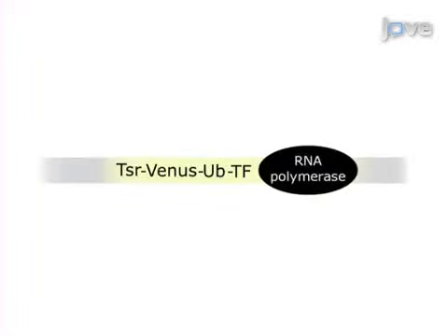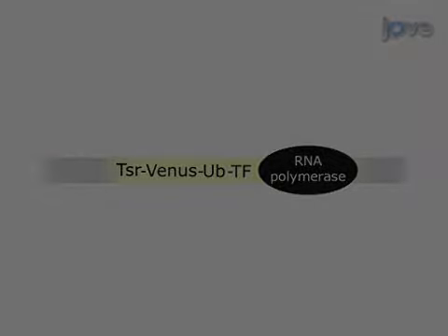To engineer the strain, insert sequences encoding a membrane localization.